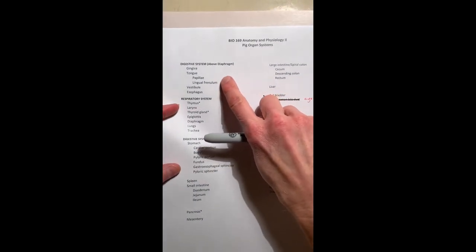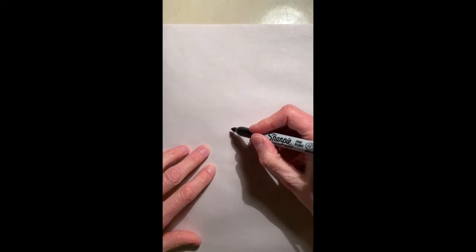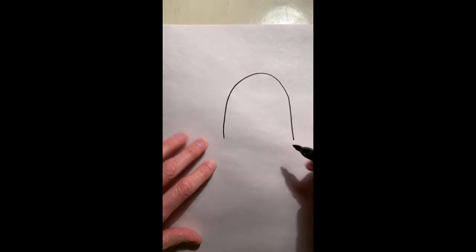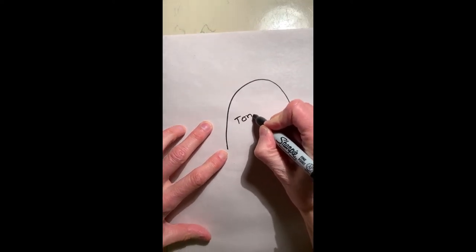This is the part of the list that we're tackling right here in a drawing. First thing on your list is gingiva, and I'm going to draw that in just a minute. I think the first thing we're going to look at is the tongue because that's a great marker. You can always tell where you are when you're looking at the tongue.